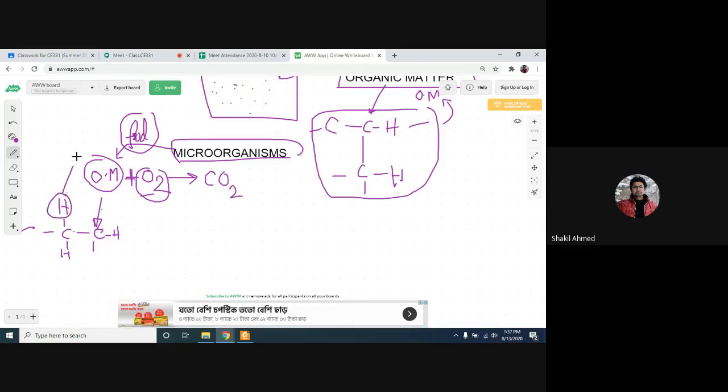So you detach them by microorganisms. So you get carbon dioxide, water, and different gas and other compounds.